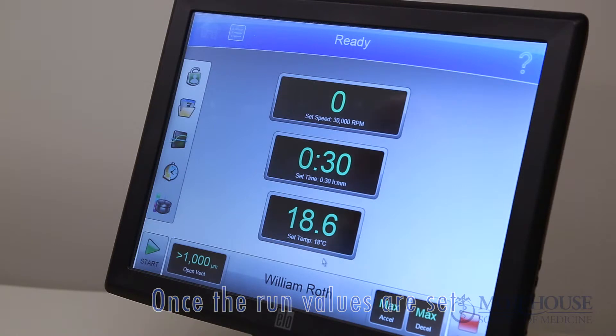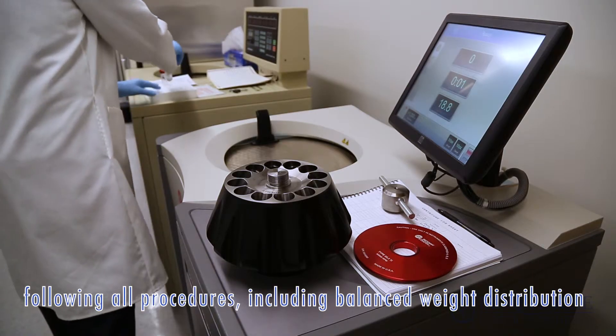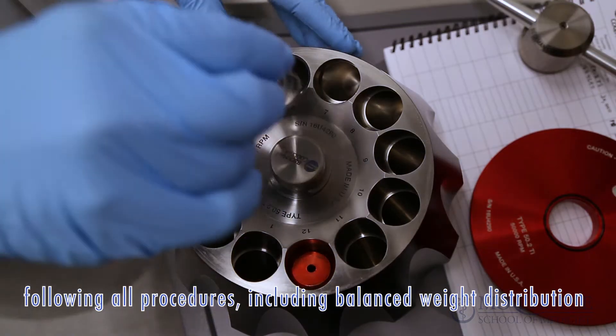Once the run values are set, prepare your samples and place them in the rotor following all proper procedures, including balanced weight distribution.